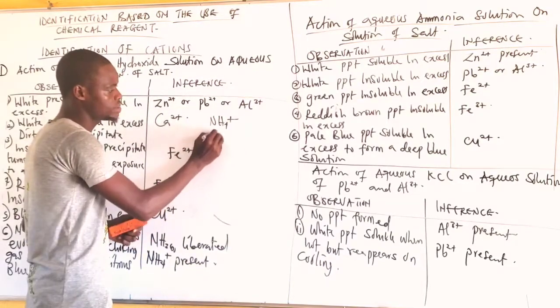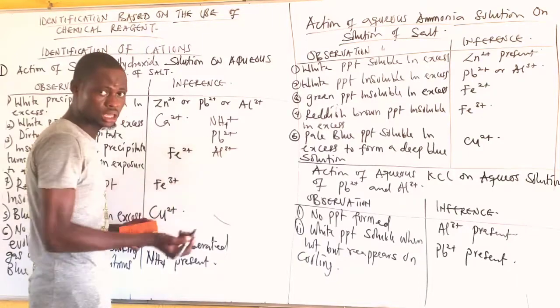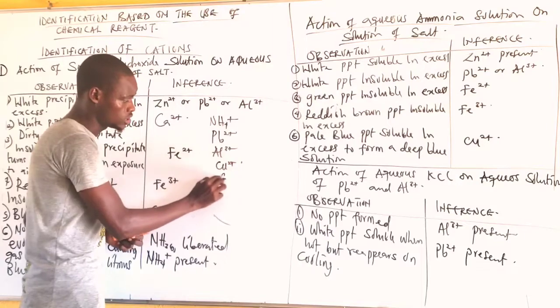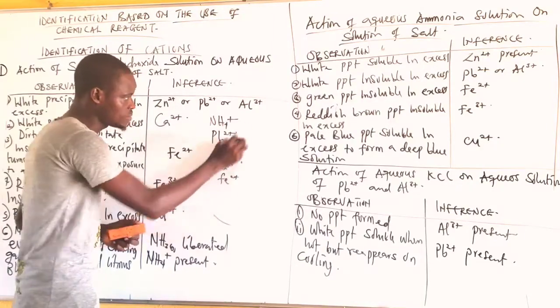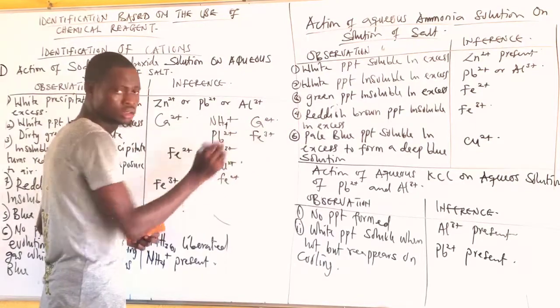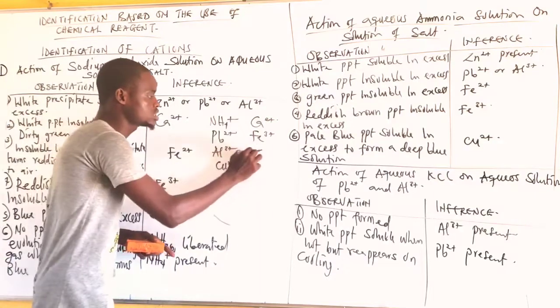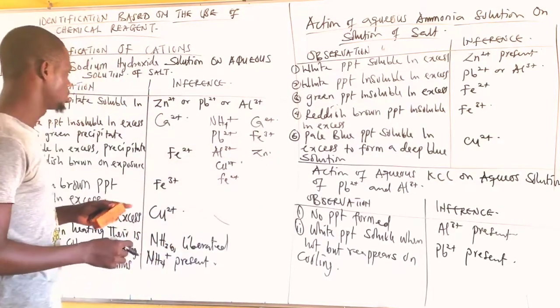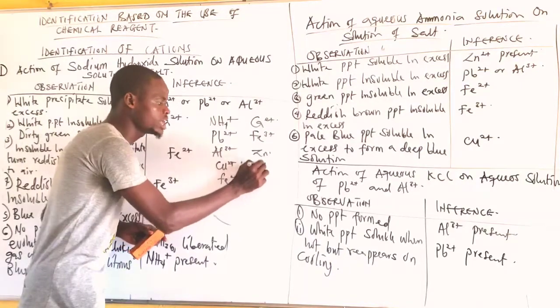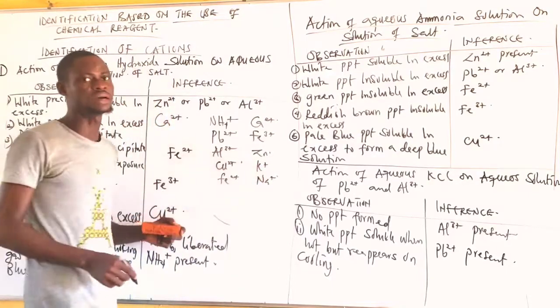We can also determine the zinc ion, the potassium ion, and the sodium ion.